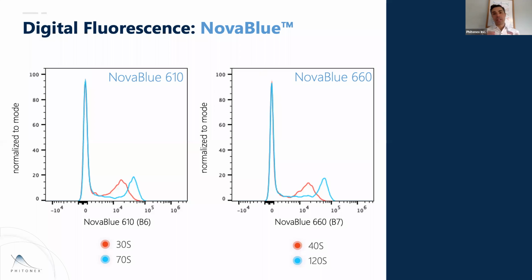So I think a couple of interesting things to point out here. One is you could look at lower antigen density markers and go brighter, but then the inverse is also true. You have very, very high antigen density markers. And we've actually had to leverage this just recently where we were doing a conjugation on CD44, and it was far too bright. And so we said, okay, what's the lowest brightness that we could have across those fluorophores, and then drop it into there, right? And then essentially bring that down to not spread elsewhere into our panel, which was honestly a lot of fun to have the flexibility to be able to do that.